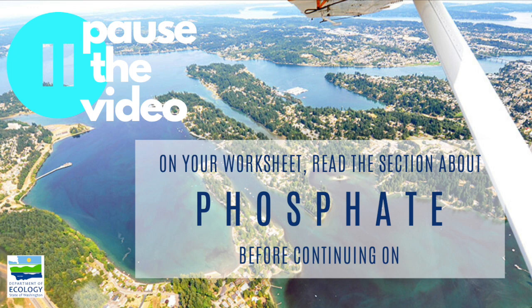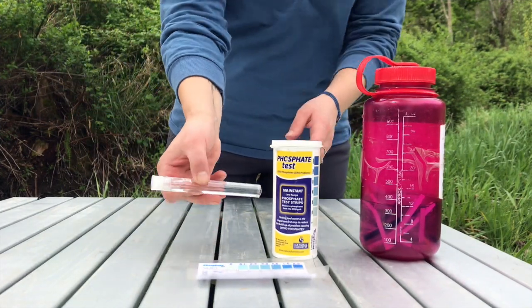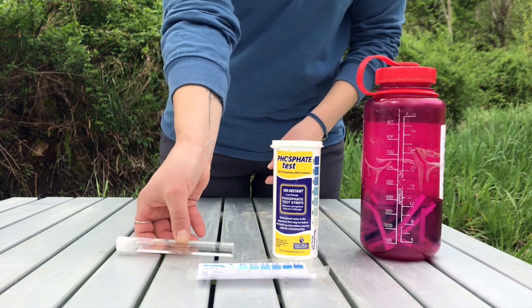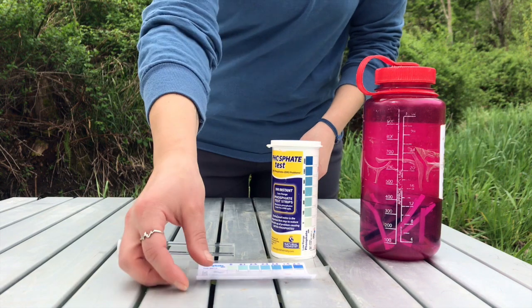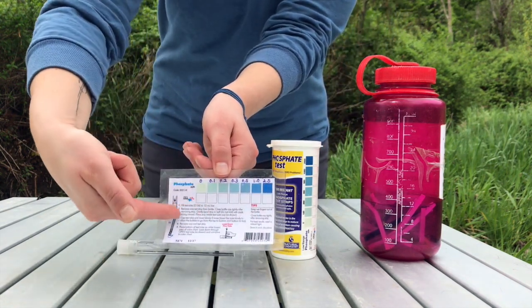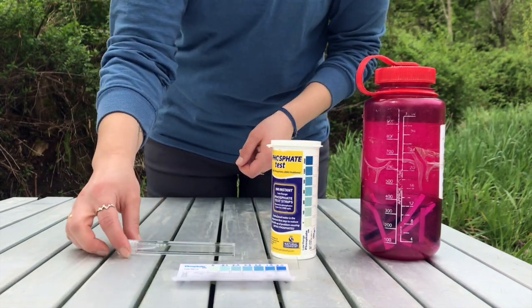In order to test for phosphates, we collected 10 milliliters of water from Jones Creek, and we'll be using test strips designed to react with any phosphates present in our water sample. Similar to the DO test, our water sample will change color, and then we will compare our sample to a standard.